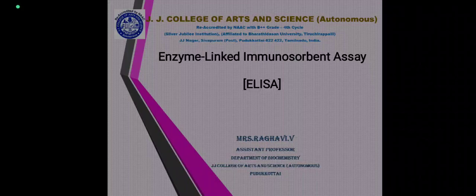Good morning everyone. I am Ragavi, working as an assistant professor in the Department of Biochemistry, JJ College of Arts and Science. Now we see about a topic in immunology, that is a technical topic, enzyme linked immunosorbent assay. It is shortly known as ELISA.